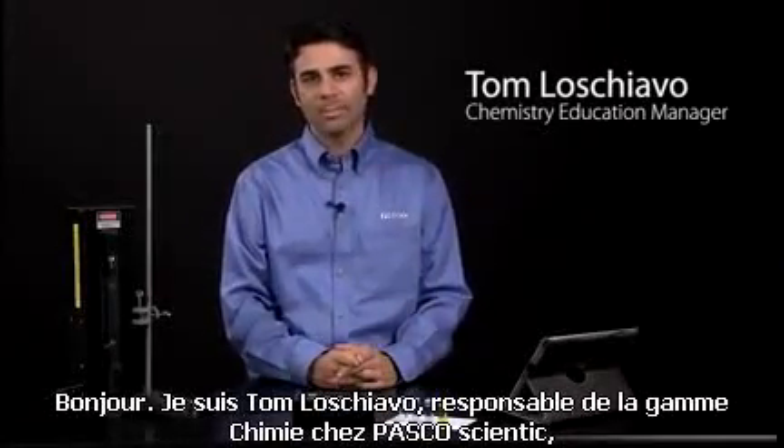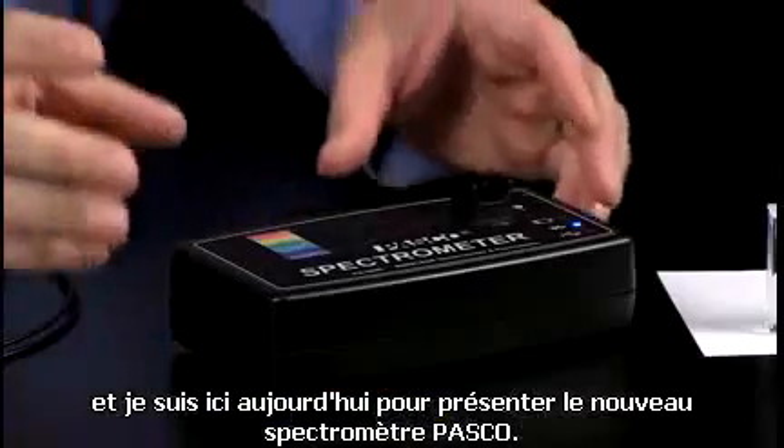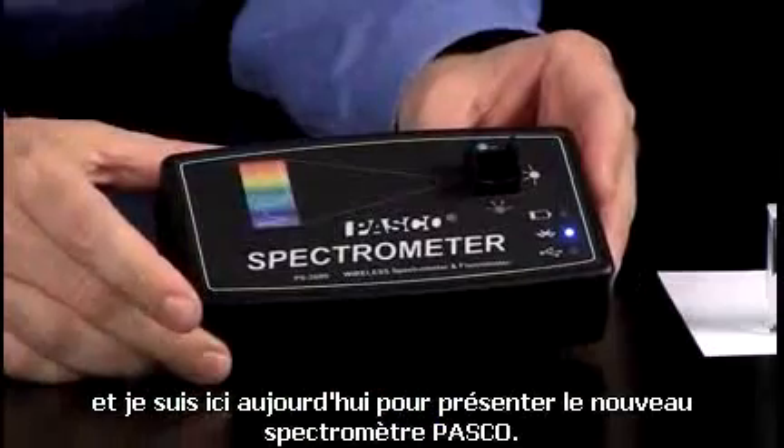Hi, this is Tom Luschiavo, Chemistry Education Manager at PASCO Scientific, and I am here today to introduce the PASCO Spectrometer.